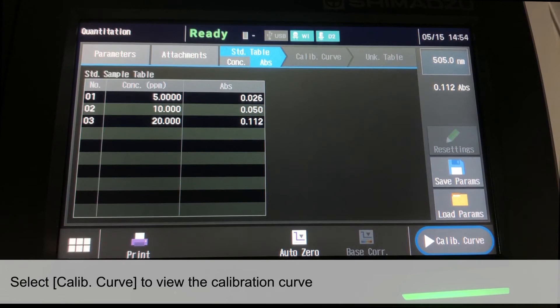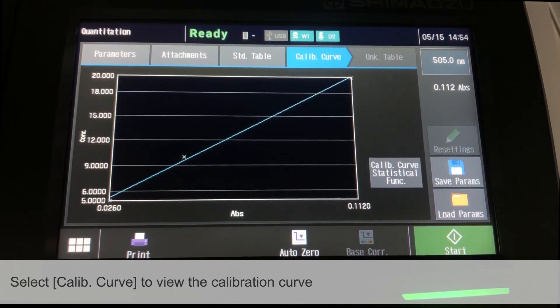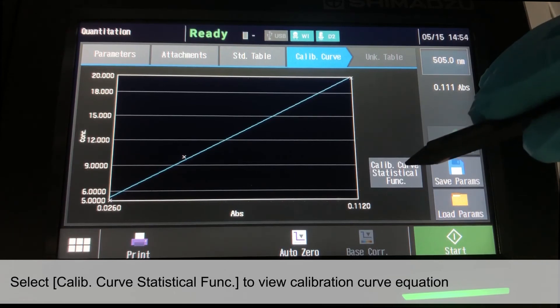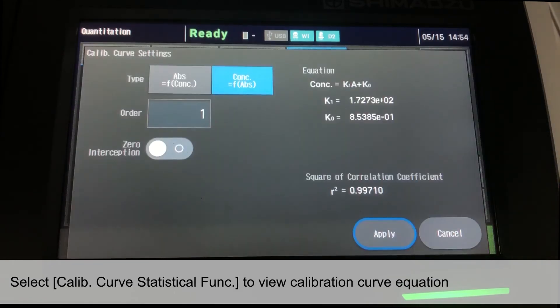After the Standard Sample measurement is completed, select Calibration Curve to view the curve. Select Calibration Curve Statistical Function to view Calibration Curve Equation.